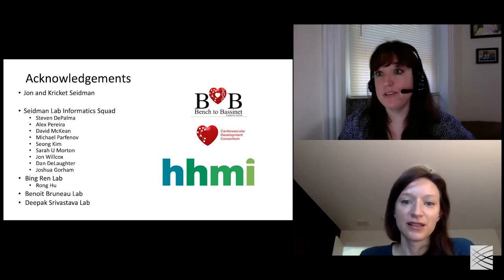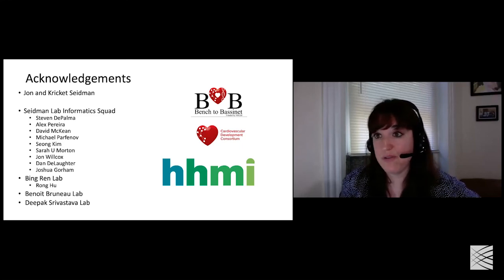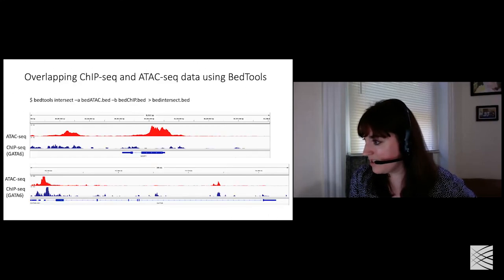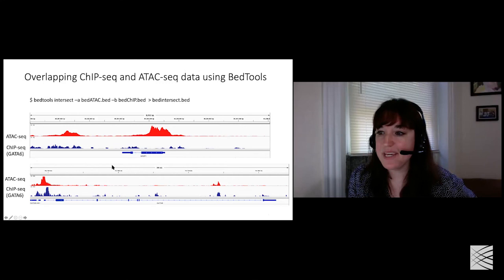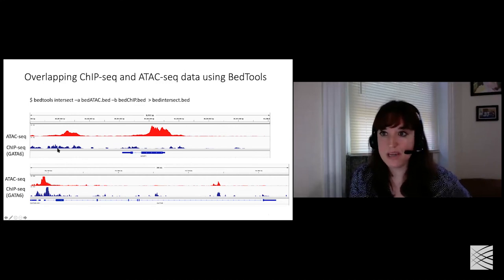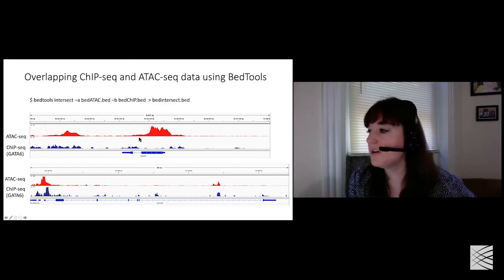That's a great question. So what you would want to do is, say you have a wild type and a mutant, right? So let me try and go back to some slides here. Instead of this being ChIP-seq, let's pretend that this is ATAC-seq. And so you have ATAC-seq for a wild type and you have ATAC-seq potentially for a mutant. So you can do differential peak expression analysis for both ATAC or ChIP by comparing a wild type and a mutant, or two time points, for example.